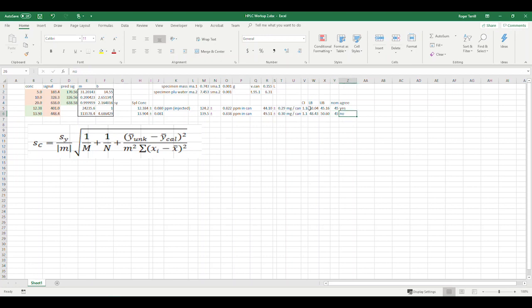So without having a lot of accuracy built into this, accuracy assurance is built into this experiment, like spike recovery and method blank and internal standards, things like that. It's hard to say. But if these are accurate values, this one agrees and this one doesn't. So we don't really need to say too much about that for this report.